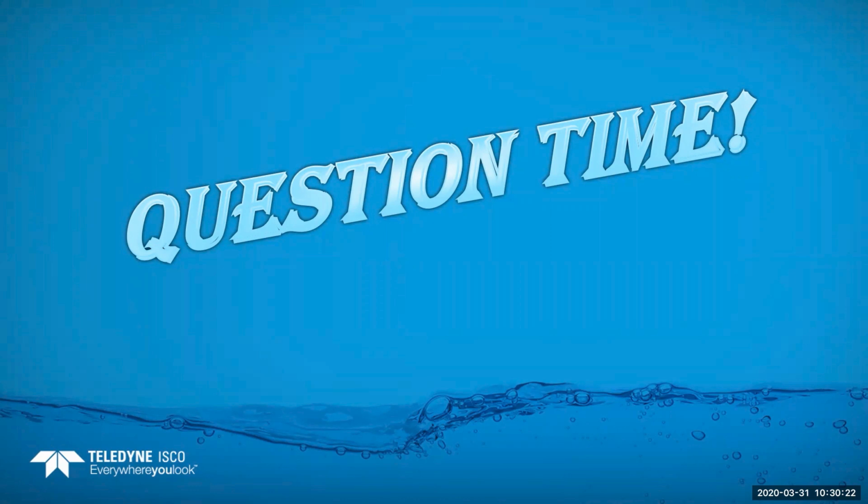The 5800 has a bottle number output. Why with the 306 Tynet? They're talking about the bottle output numbers. If it always says number 1 on the screen for the signature, that is usually because if it's in a composite mode, it just means it's taking the sample. It doesn't keep a number of the samples. If you have it in the 24 bottle mode, it usually tells you what bottle you're taking it in. But give us a call on that number for a little more in-depth help if you have more questions on that.